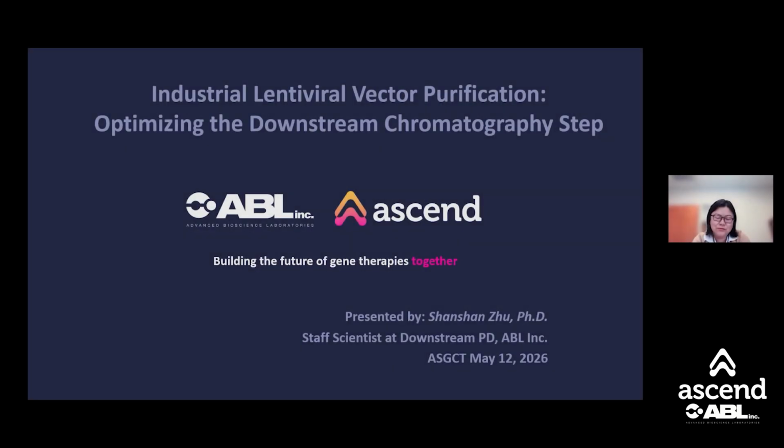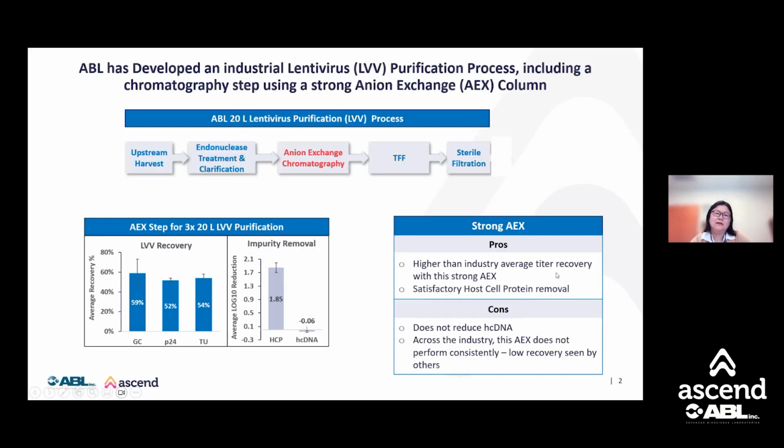It's my honor to present our work on lentiviral vector purification, focusing on the step of optimizing downstream chromatography. ABL has developed an industrial lentivirus (LVV) purification process, including a chromatography step using a strong anion exchange (AEX) column. The graph here is the average result of the AEX step from 3 of our 20-liter LVV productions.